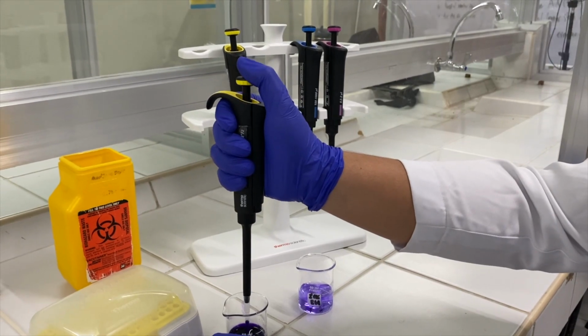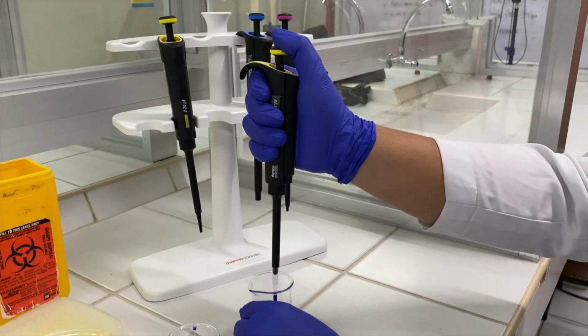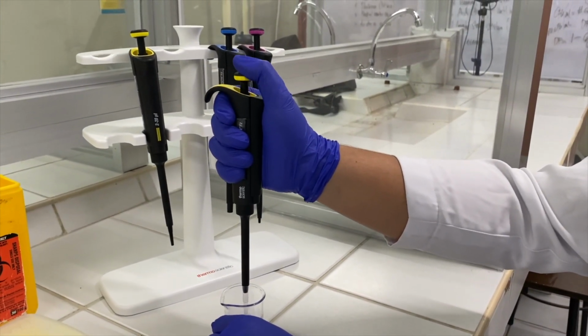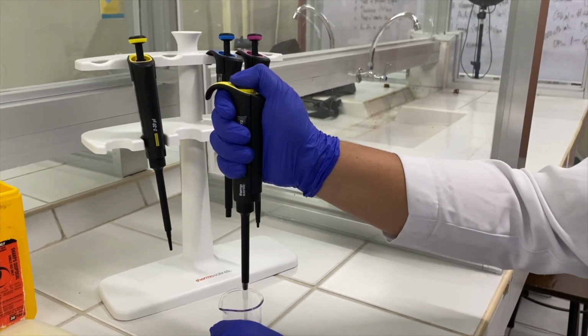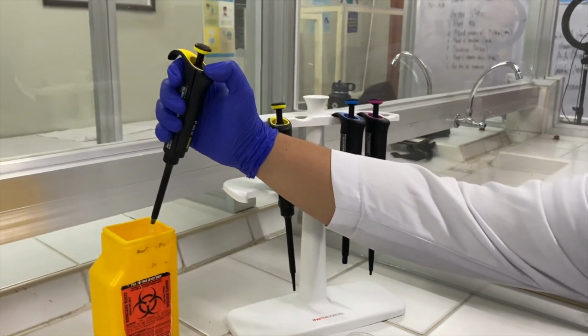Always do pre-wetting of the pipette tip before aspirating. Then dispense the solution by gently pressing the plunger up until the second stop. Forward technique is appropriate for aqueous solution.